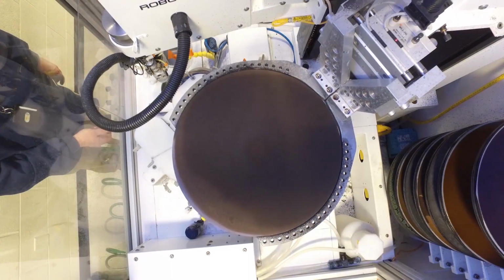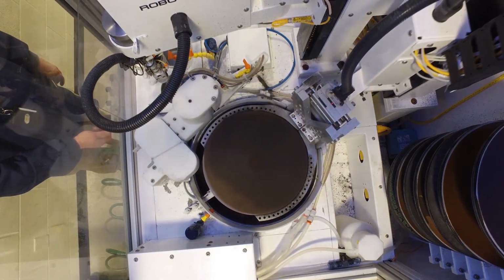I built the system behind you. This materials characterization system, which is robotic and automated, is the next generation of tools to provide information on material structure to advanced Air Force materials.